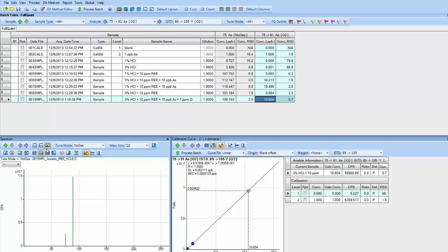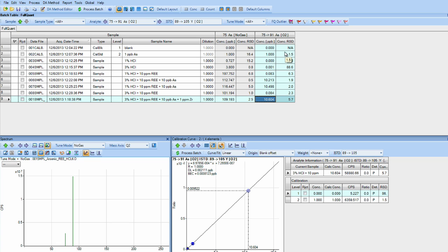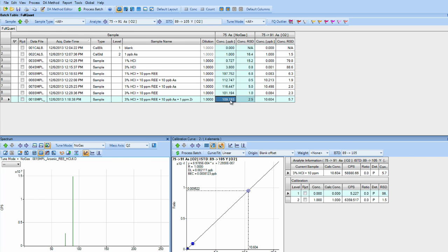So let's take a look at our data. We did our calibration for 75 arsenic in no gas and 75 mass shift to 91 in oxygen mode. In 75 no gas, which we calibrated in half a percent HCl, we have a detection limit of only 40 PPT with a BEC or background equivalent concentration of 1.4 PPB.